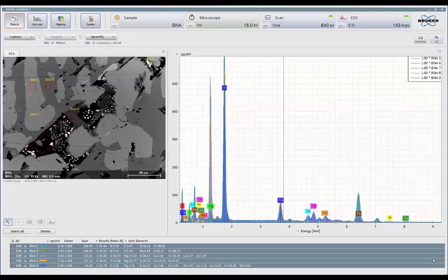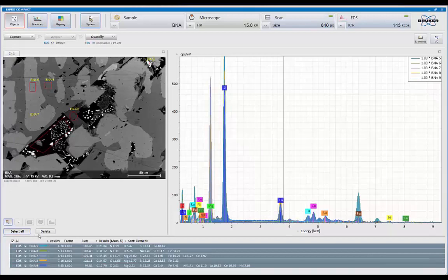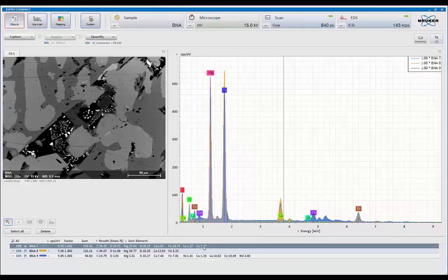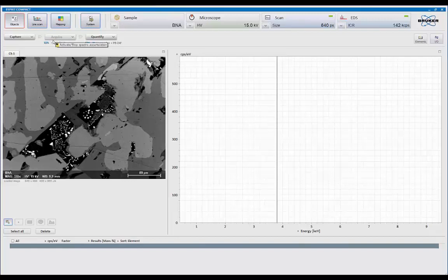At this point, let's take a look at some of our other capabilities. So one of the things I'm going to do right now is select everything, reset the display. So I'm going to get rid of all my spectrum here. And then let's collect a new image.